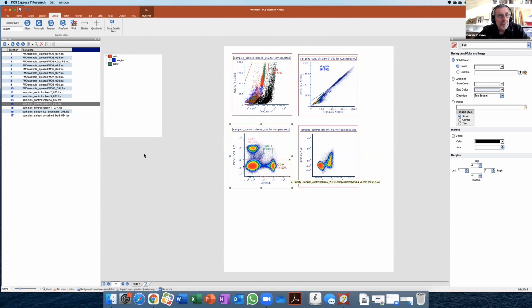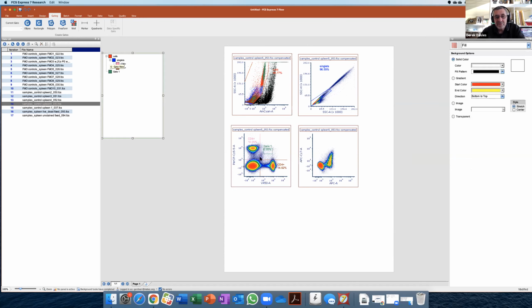Yeah, I think you're right, Rui. You don't want to get too hung up on a tiny difference like that. If you've got a big percentage, it's really not going to make a lot of difference. And also, you're never going to be doing this experiment once, are you? So you're going to have a range. In fact, if you rerun this sample, you'll get a slightly different percentage in there. So we always have to realize that there's always going to be variability. Some of it is biological, some of it is what we do to the samples as well, and it's what we're prepared to put up with.